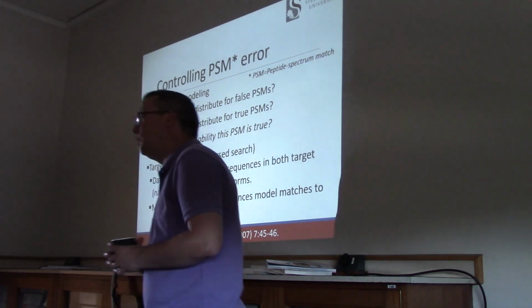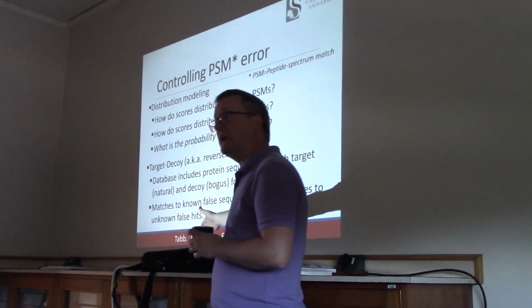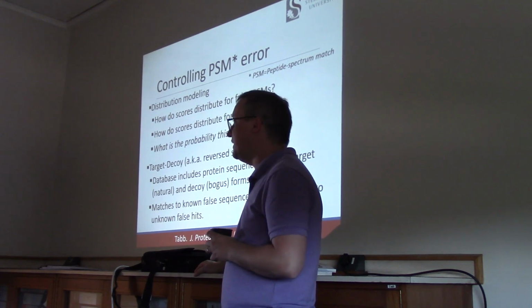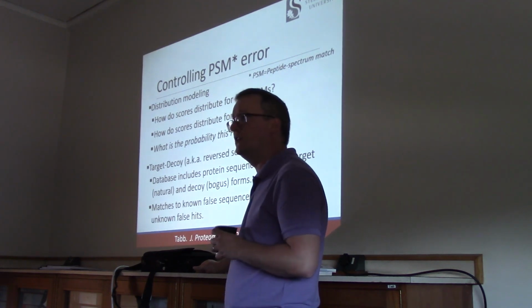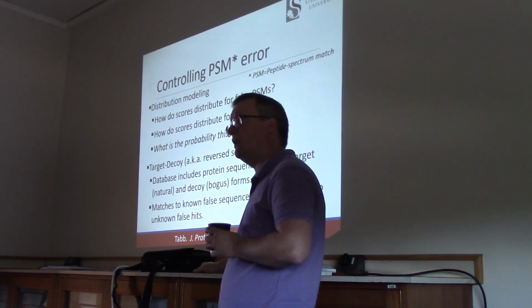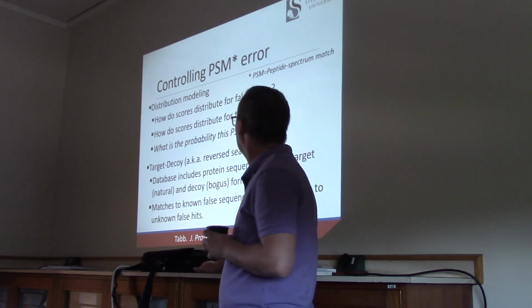So how do we control this error? There are two big approaches that get used most frequently. I think many people now are accustomed to using systems like the Trans-Proteomic Pipeline, the TPP, or Scaffold software. These are really popular worldwide.